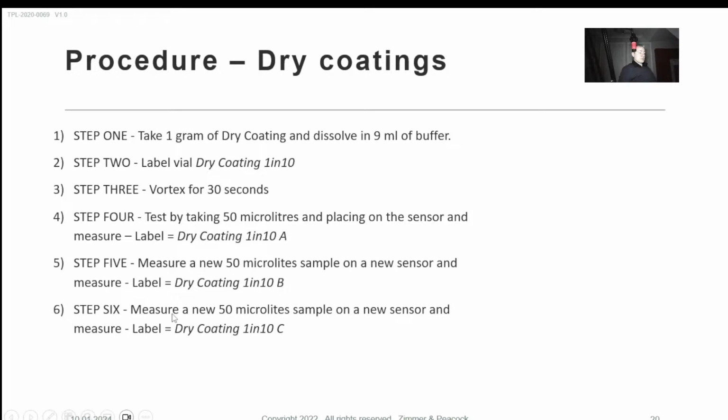So you actually have to sample and test several times. That's why I'm also saying that that's what's wrong with HPLC, because the cost of HPLC, just out of interest, to run the HPLC extraction method takes about 5 hours. So you can see that people just simply can't do the amount of testing that it takes to understand these complex samples.